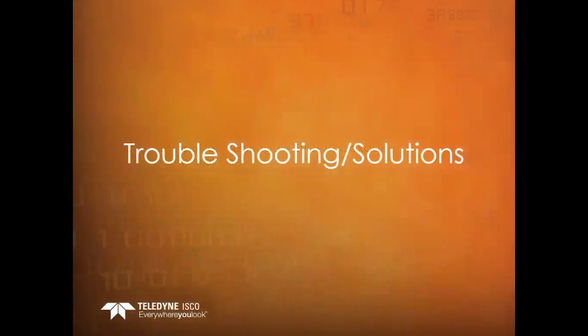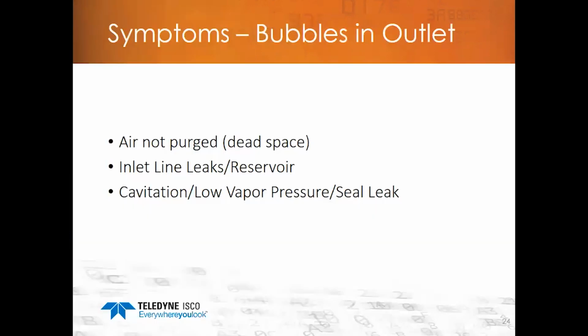Next, we'll talk about some troubleshooting solutions. Symptoms such as bubbles in the outlet can be caused by the air not being purged from the system. Note that there is a dead space between the top of the piston and the cylinder cap where the air needs to be purged. You could have inlet line leaks, or the inlet line is not placed down to the reservoir as needed. You could also possibly have cavitation problems caused by low vapor pressure fluids.